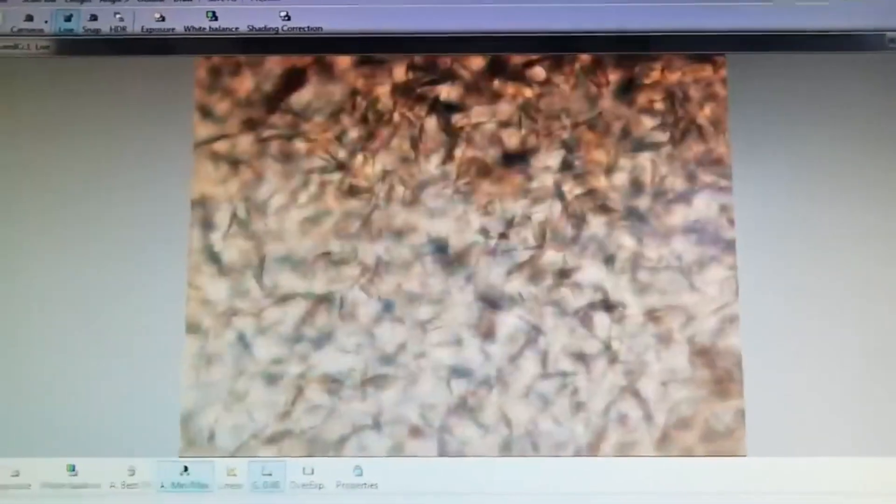In diestrus phase only leukocytes you will see. Here you can see cornified cells - it is estrus phase. In diestrus phase only leukocytes are present.